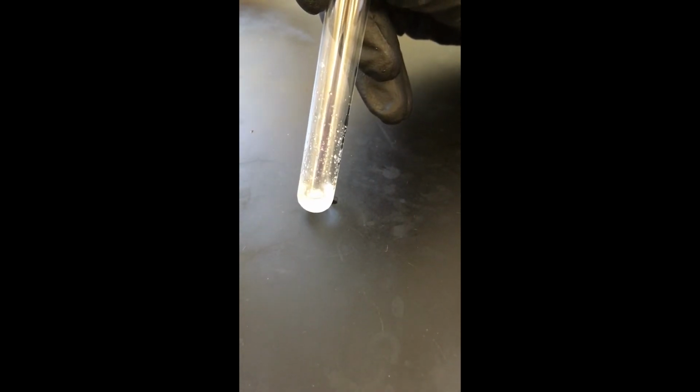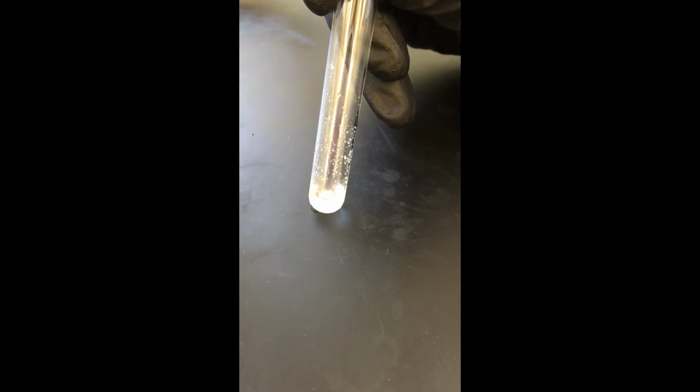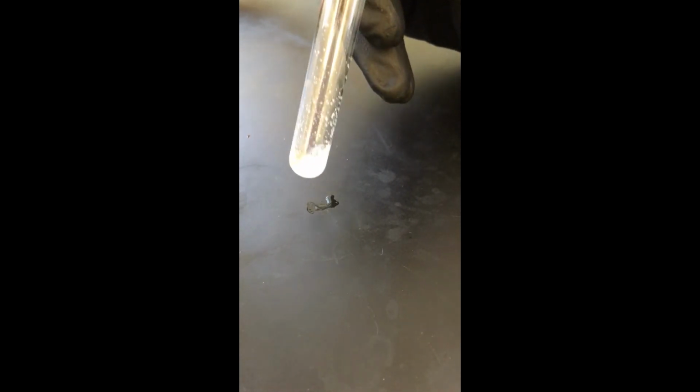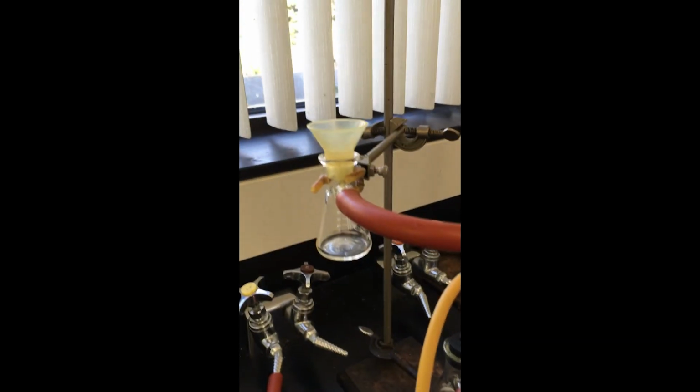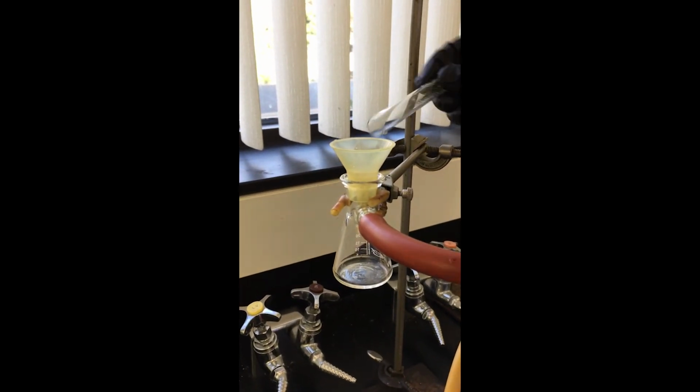So just like I did earlier, I'm going to go ahead and take this and vacuum filter it, and then I'll collect it and weigh it, and then we can do the melting point and IR. So just go ahead and end it.